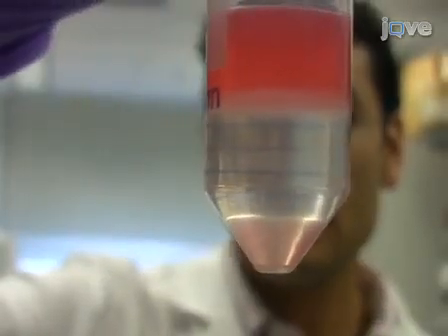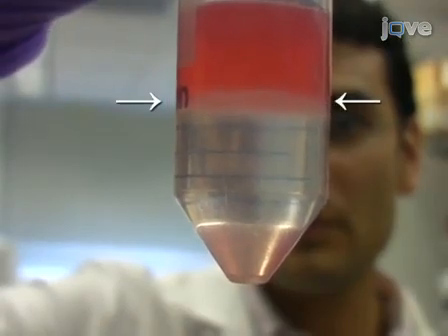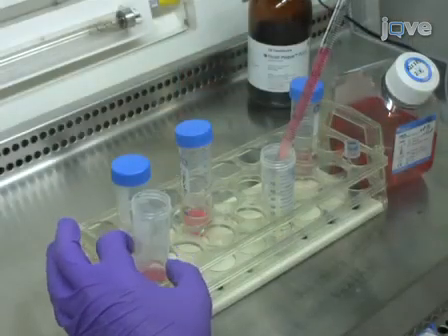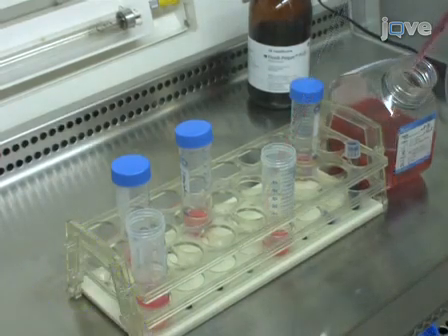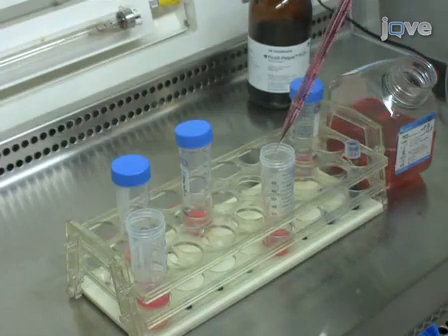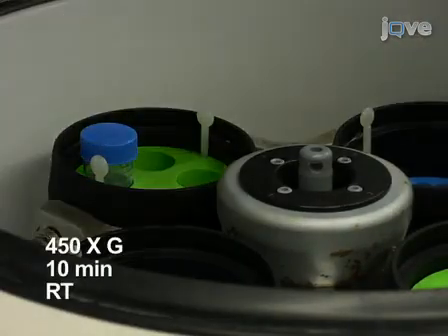Following the centrifugation, the viable cells will be at the interface of the Ficoll-Paque Plus and cell dissociation buffer. Transfer them to a new 50 milliliter conical tube. Add fresh DMEM supplemented with 10% FBS to the cell suspension to dilute it 1 to 3. Centrifuge the isolated cells at 450 G for 10 minutes at room temperature.